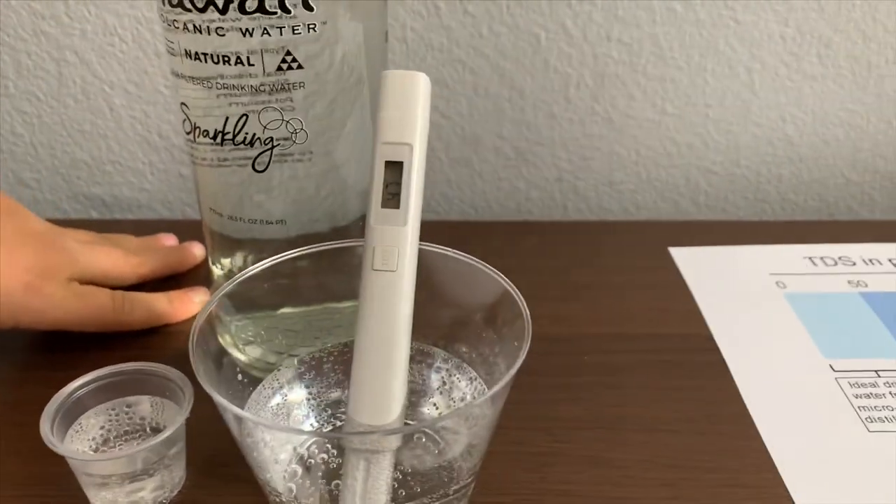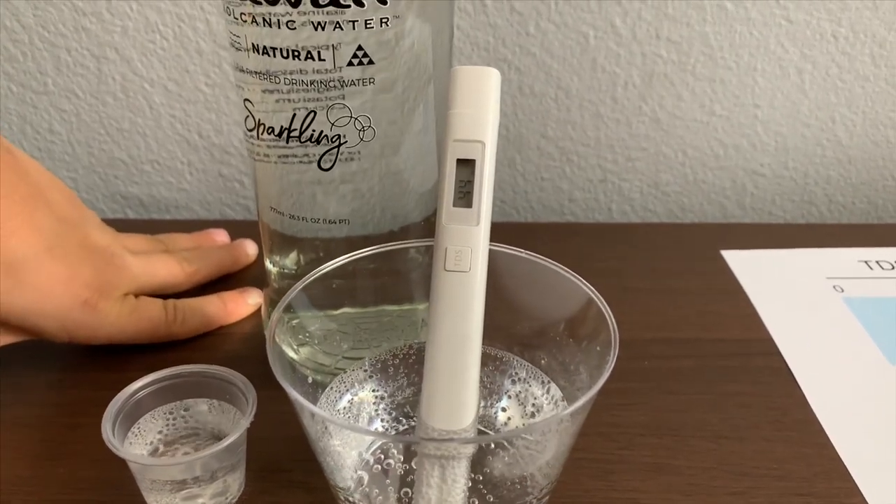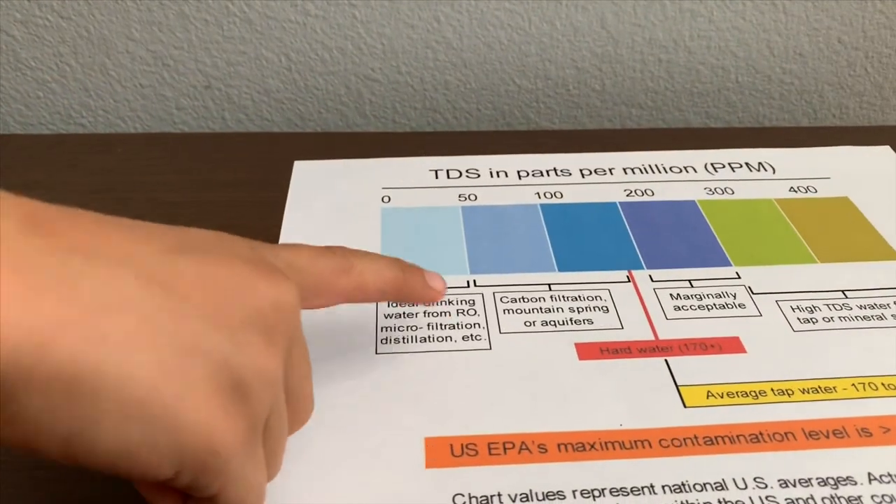Forty — it's in the tens to about 50. So that's like ideal drinking water.